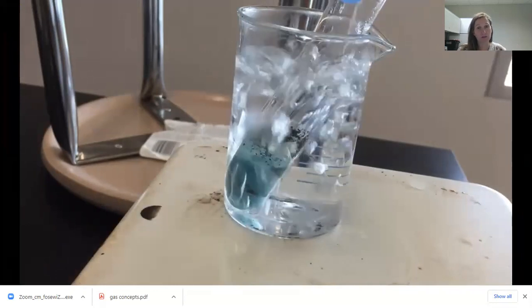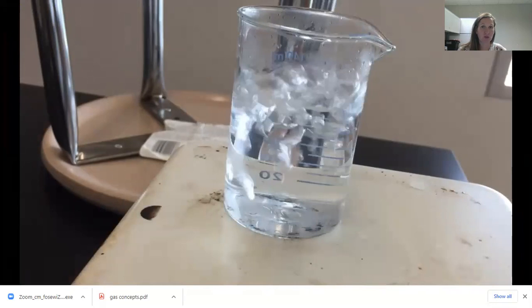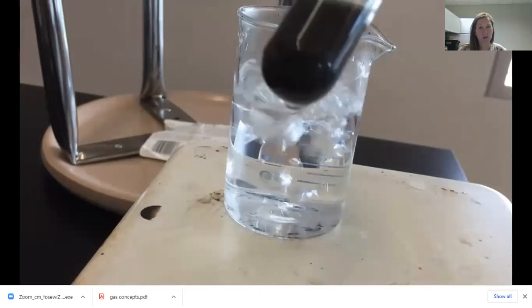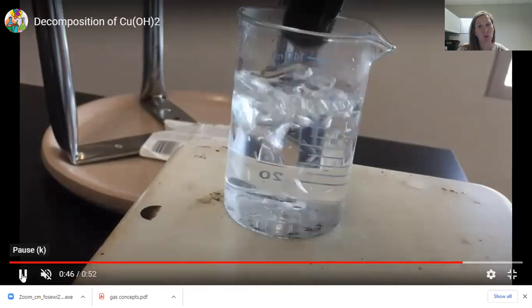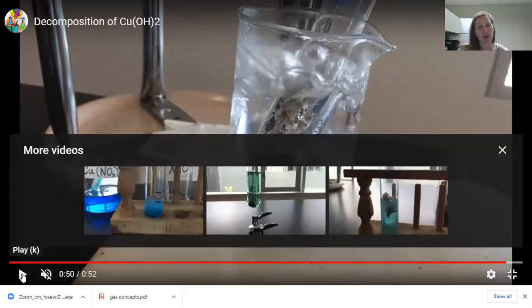Now both are solids in water, they're both insoluble in water, so they're both going to be precipitates. But the color change is what really indicates the reaction changing. That copper 2 oxide is black. And once the reaction is complete, all of the copper 2 hydroxide, the blue white solid, is gone, and all that's left is copper 2 oxide.